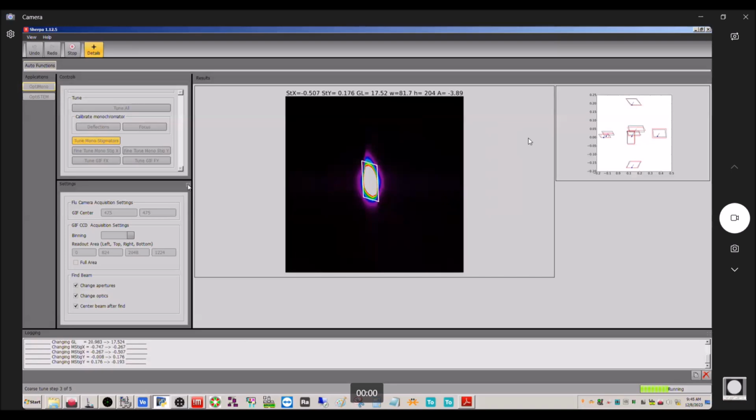So the end goal of this, of course, is I want to collect some EELS spectra with the filtering, and show you the difference between the filtered and unfiltered version. So I collected unfiltered spectra from the same particles beforehand.